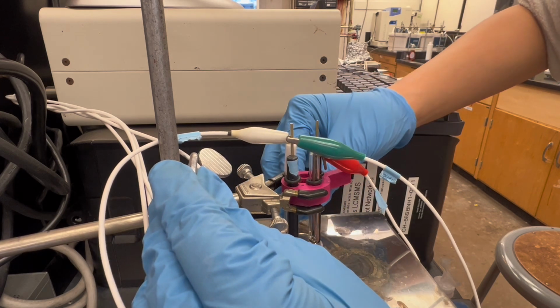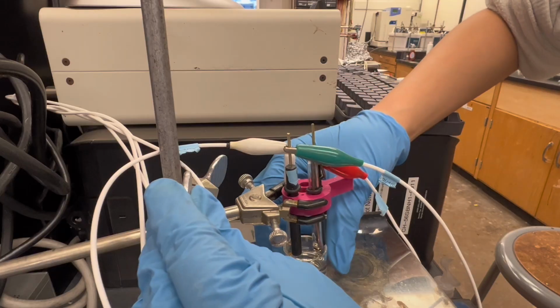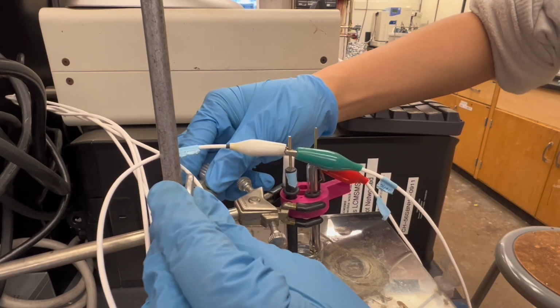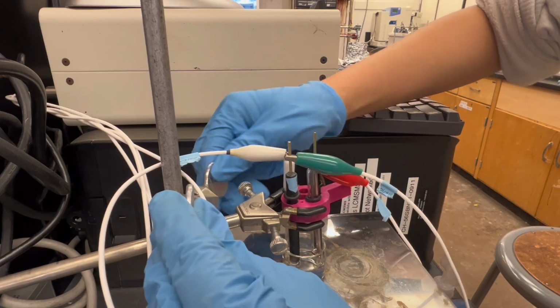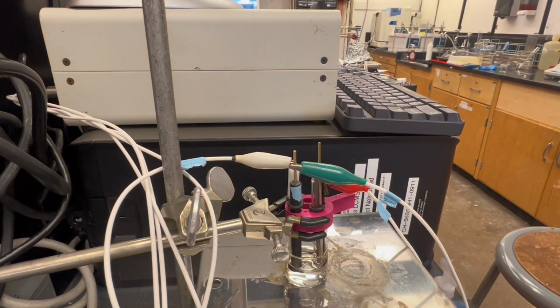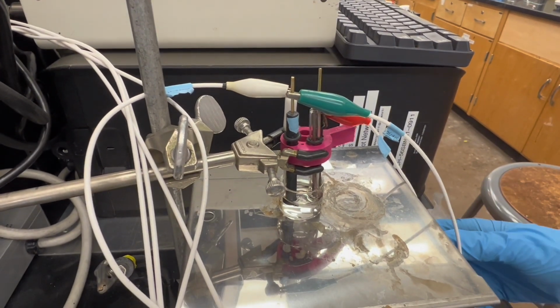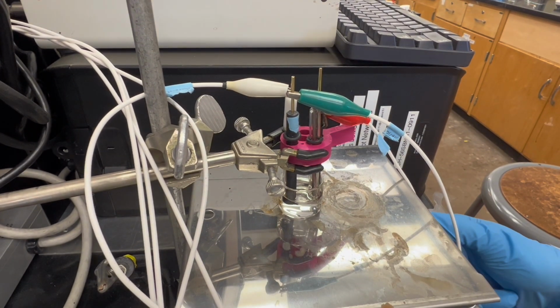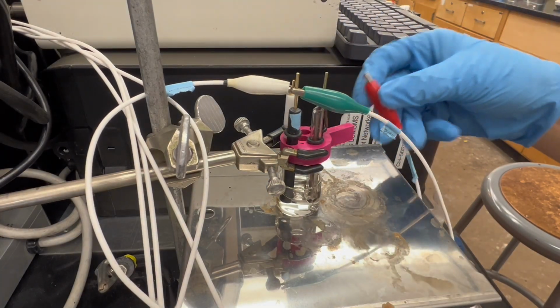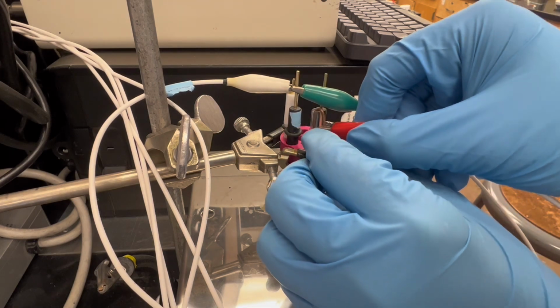And this is for the electropolymerization experiment for our second electrode. We keep the first one on the cell, and also make sure to switch the solution every time for each electrode. And we also switch the wire to connect to the second electrode. And also make sure they're not touching each other, they're not touching the bottom or the edge, and they're connected well.